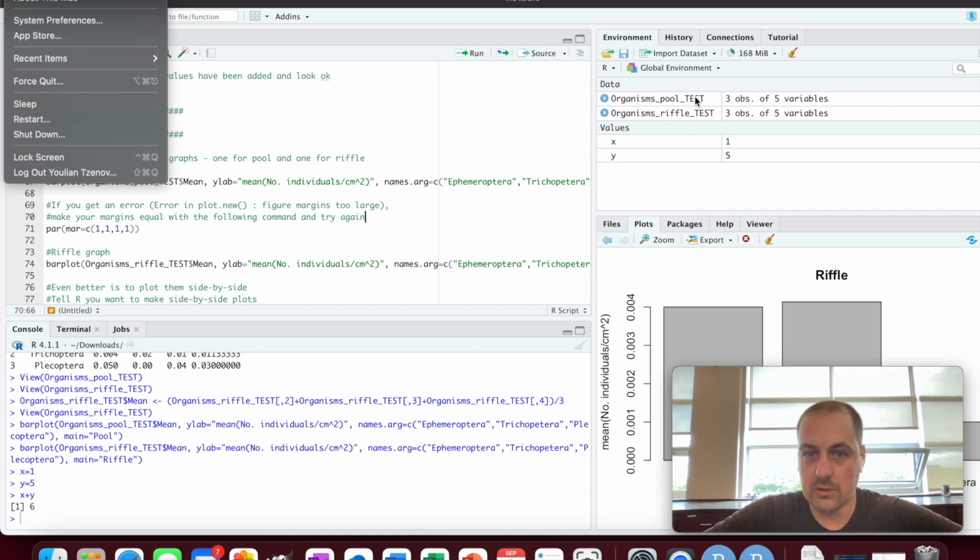The fact that your files showed up here means that you have downloaded and imported those successfully, and your name or something close to your name will come up here so that I know you actually did this on your computer. So if you take this screenshot, upload it to the Lab 2 pre-lab submission folder on Brightspace, that'll get you 1%. You don't need to go through many of these commands, like you don't need the graphs and all that stuff for today. Just want you to install the software and import these two files and show me that it is actually your computer.